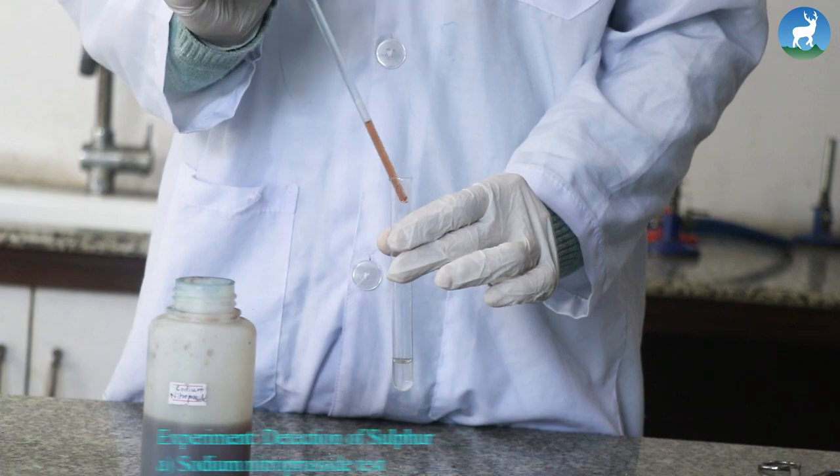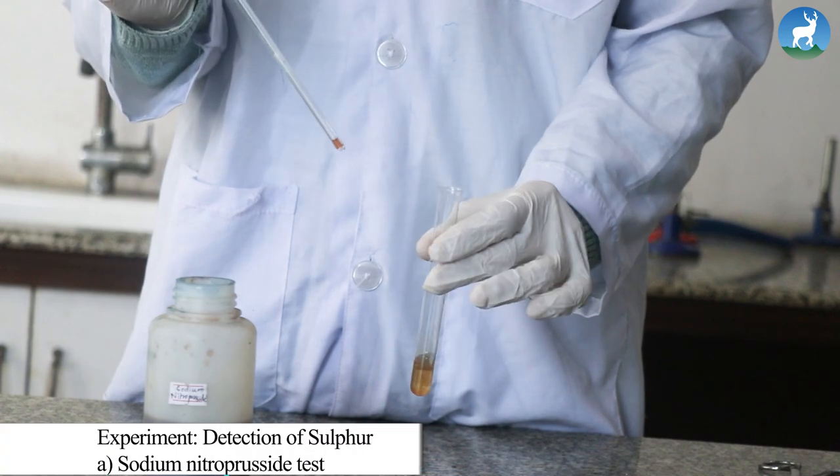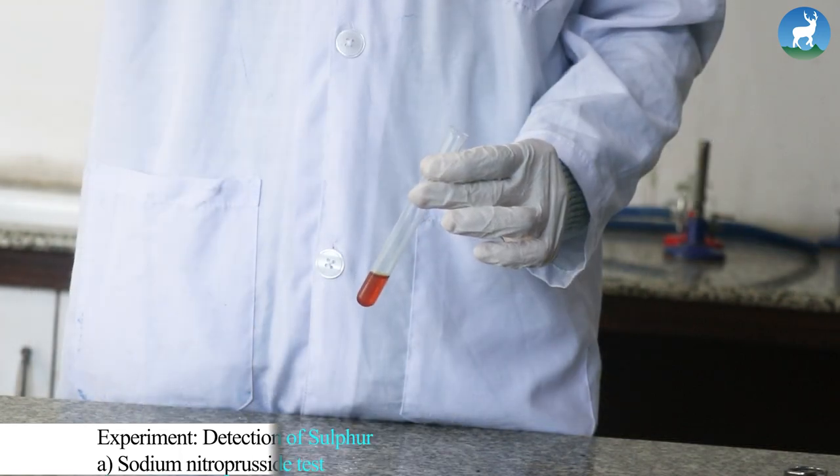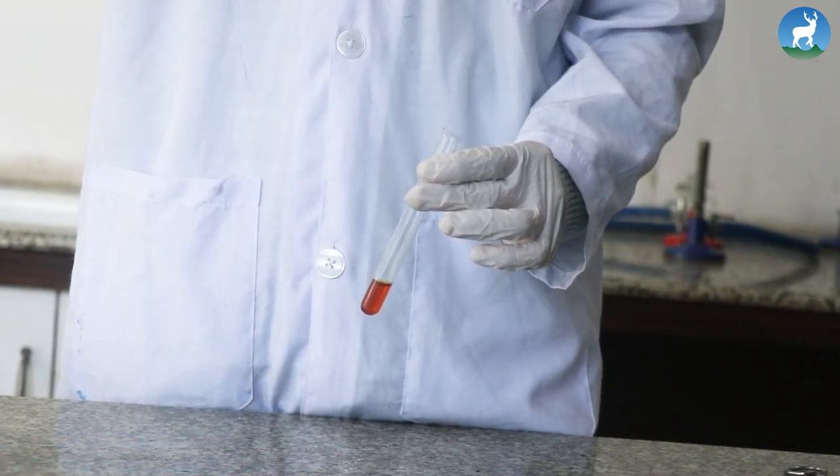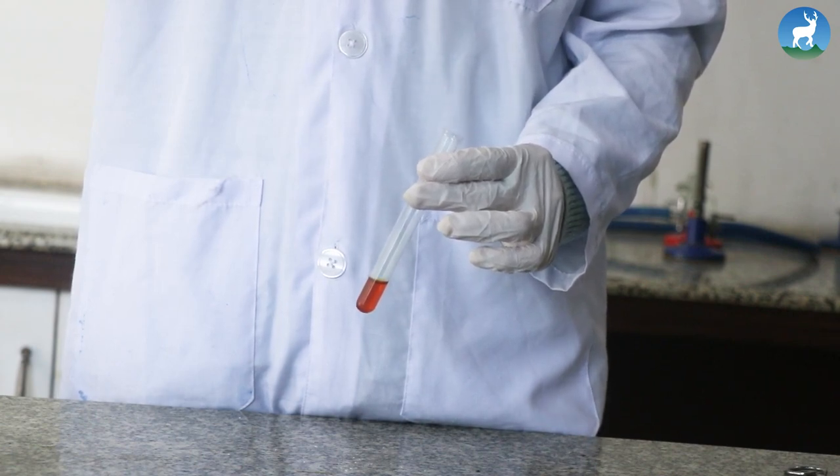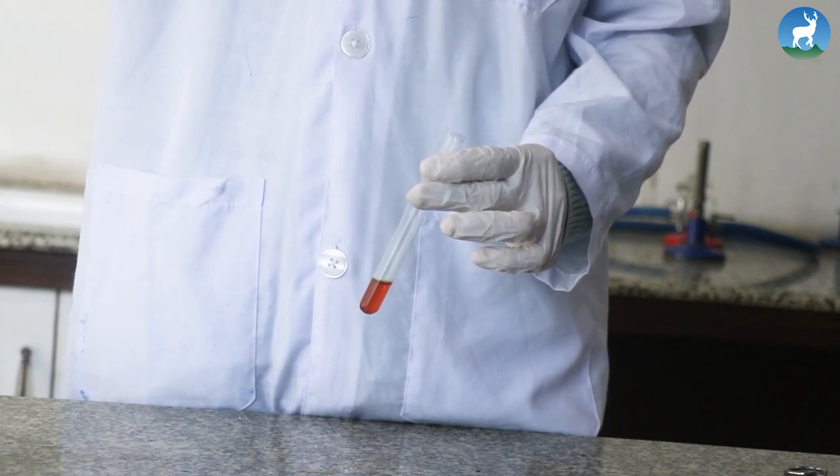Add a few drops of sodium nitroprusside solution to about 1 ml of sodium extract. The appearance of violet or purple coloration indicates presence of sulfur. Since there is absence of violet or purple color, it is proved that sulfur is absent in the given solution.